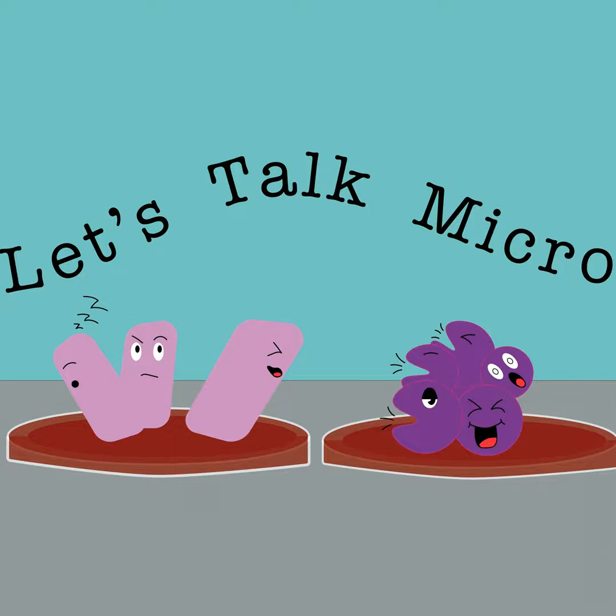It's like, why perform all this stuff when I can have an ID in 10 minutes? I do get it, but like I always say, and once I talk about automation I will build up more on this, you have to know what you're looking at. You have to recognize the morphology of your organisms. You have to recognize the biochemicals, so you know that you have a correct ID.